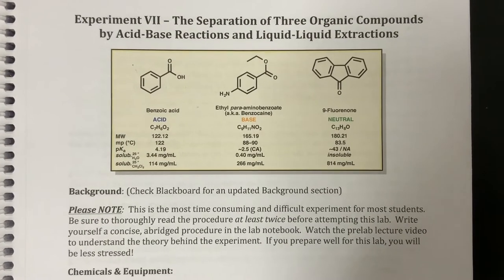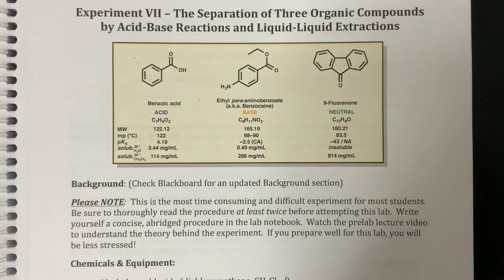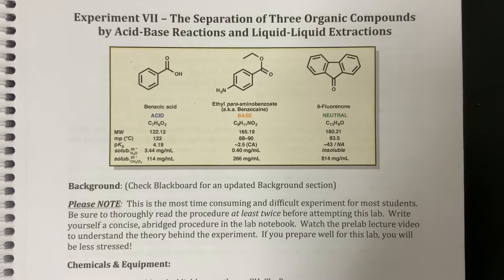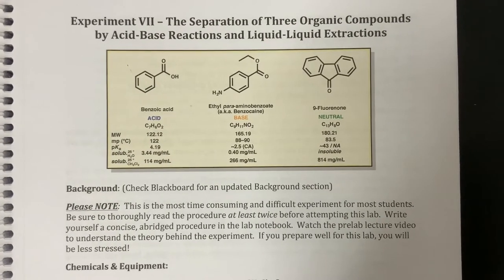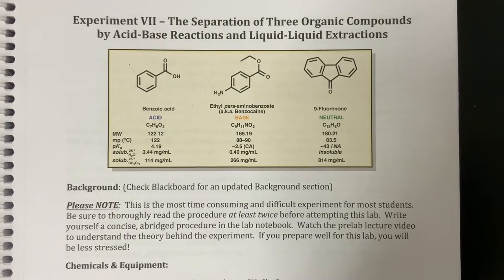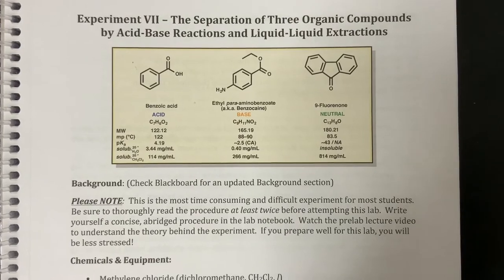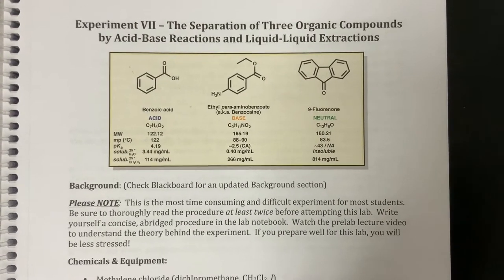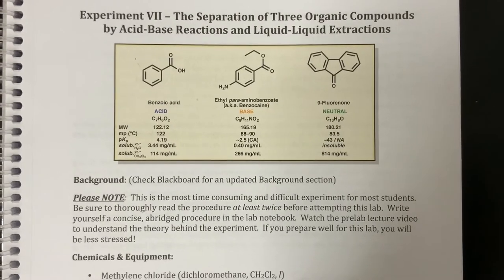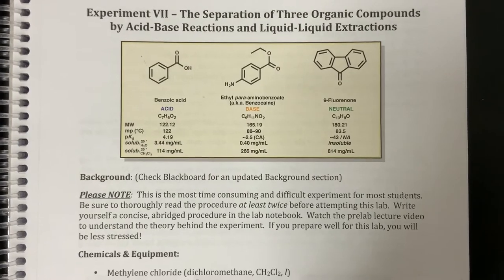This is experiment 7, the separation of 3 organic compounds by acid-base reactions and liquid-liquid extractions. So at this point, we should all be familiar with acid-base reactions, also known as proton transfer reactions, and we should also be familiar with the practical technique of liquid-liquid extractions, right? That's where we separate one compound out of one layer or phase away from the other.